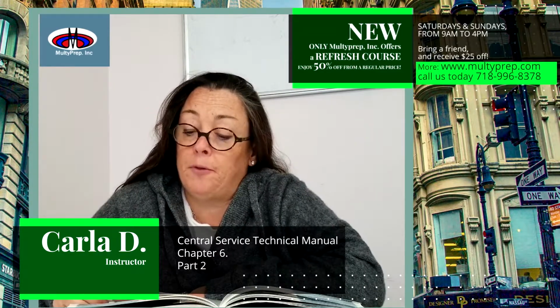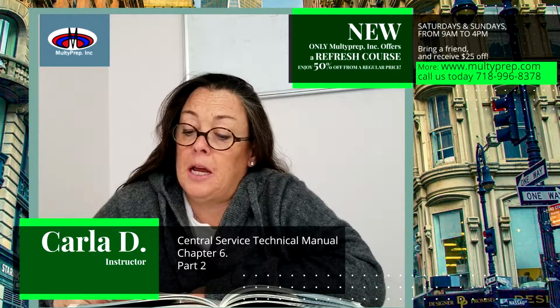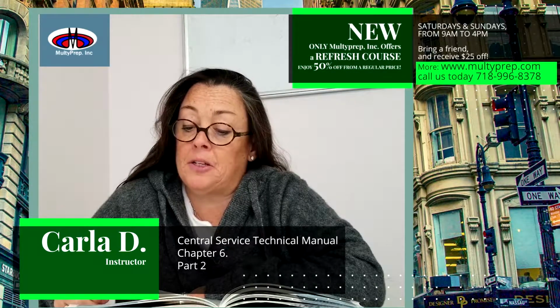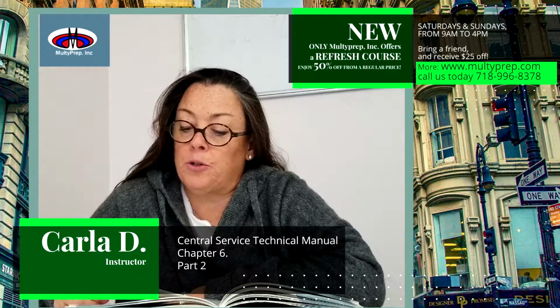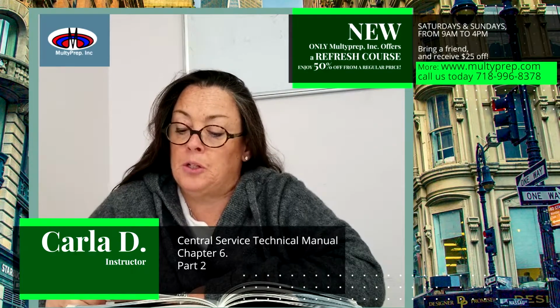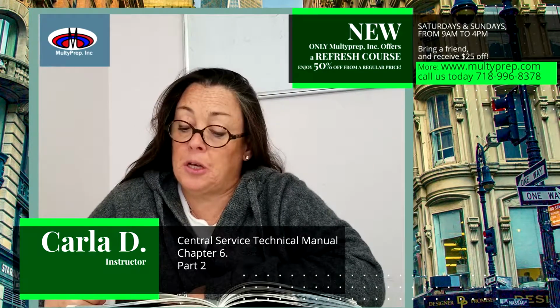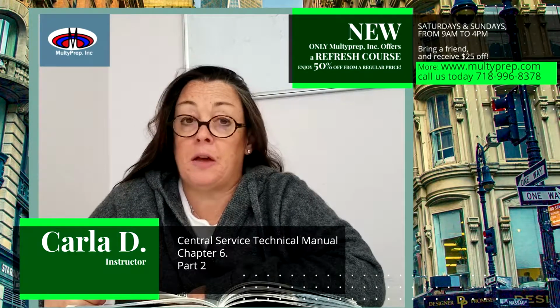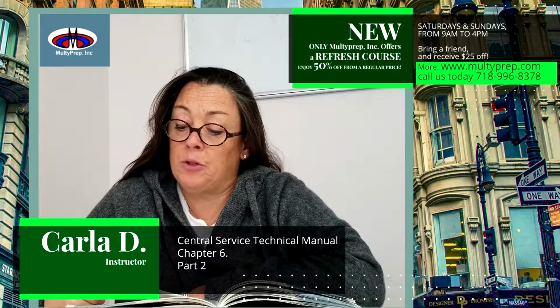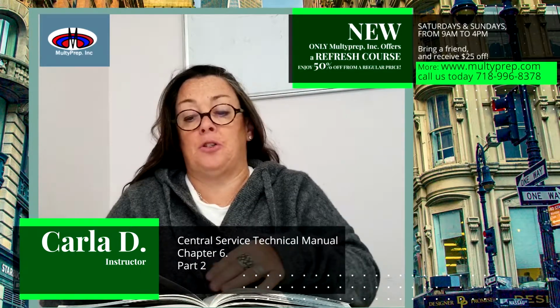Also, the use of fluorescent orange or red biohazard signs and labels to identify contaminated items or regulated waste, and they may be stored or transported in refrigerators, freezers, and other containers. See figures of these labels and signs in 6.11, and labels are not required when using red bags or marked containers. An example is in 6.12.